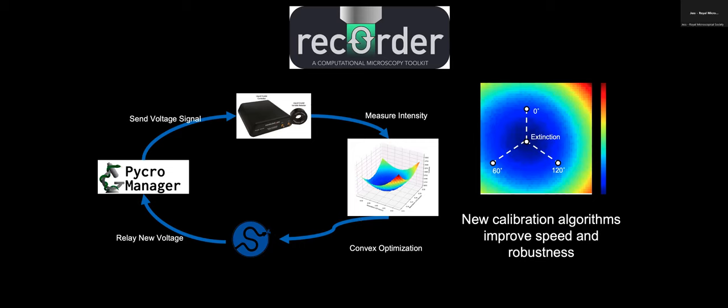Now, the ability to acquire good data with this method really requires very good calibration. Calibration is really the black magic of computational imaging. Methods succeed or fail based on how well the calibration protocols are designed and implemented. And to make this tool accessible, to make the calibration and the acquisition accessible, we have been working on an acquisition pipeline, which can be easily adopted.